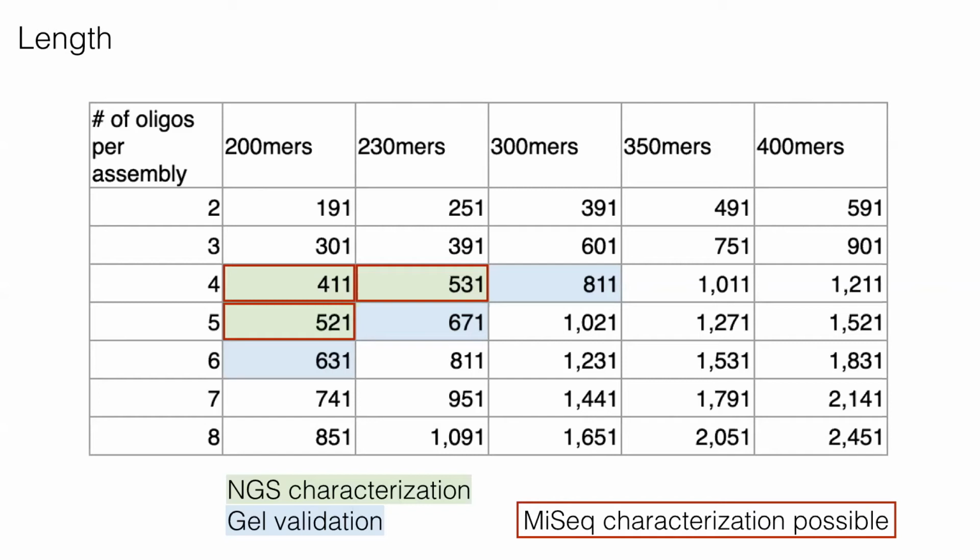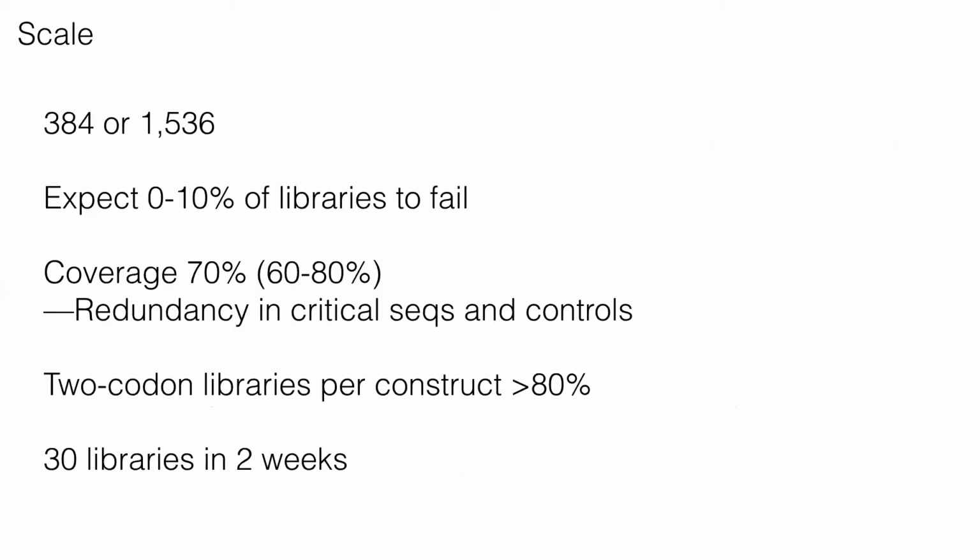So what I should say is, I think in the very near future, depending on the yield of this, it should be possible to hit about 1 kb. That should be relatively straightforward with yields that we've seen work in the past.